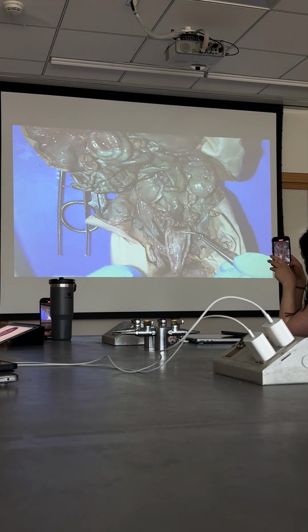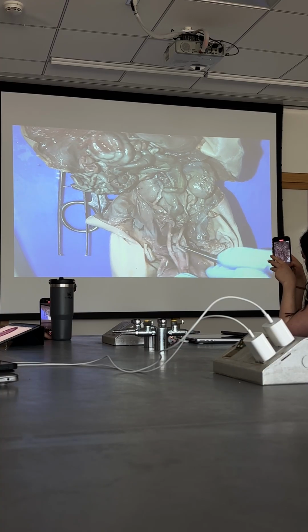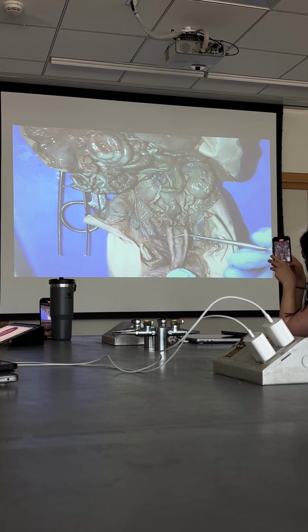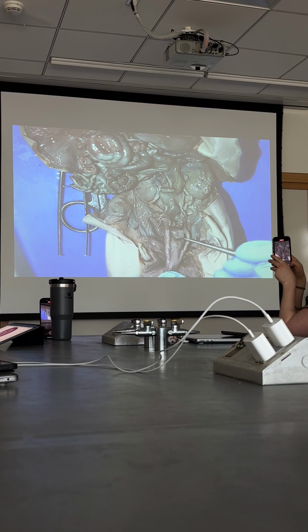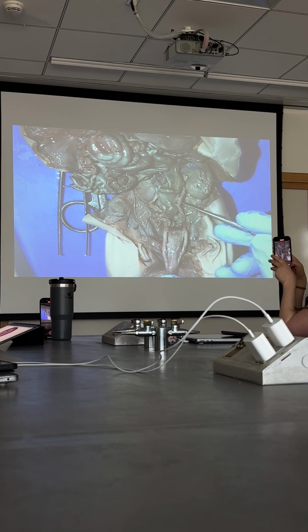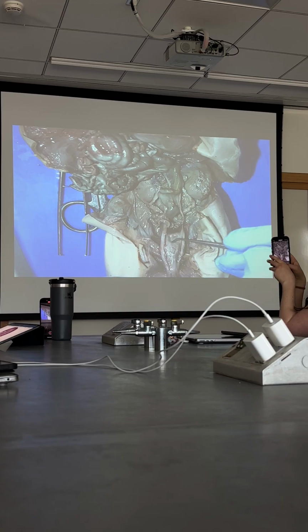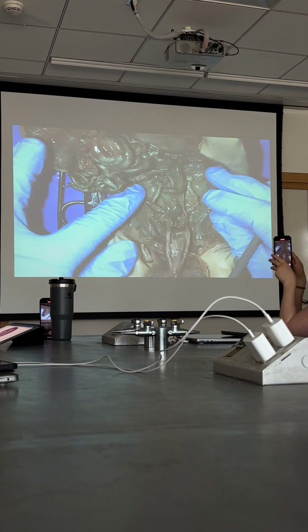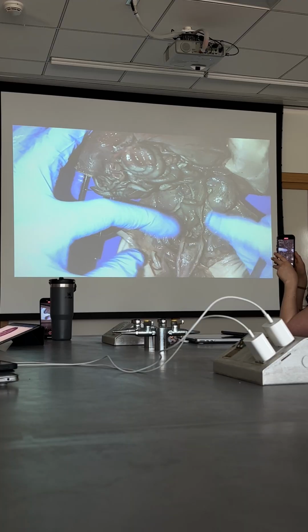That's the bladder, okay? If you remember we did this before, those, by the way, are not the ureters there. If you recall, those are the umbilical arteries. But the thing in the middle is the bladder. And it's kind of hard to see where they're connected, but the ureters are connected down there to the bladder, which is right in the middle. Okay? So that's about it for the urinary system: kidneys, ureters, and then the bladder.